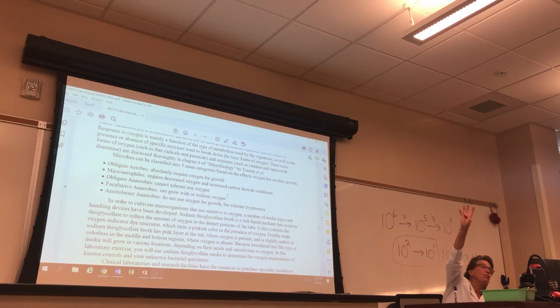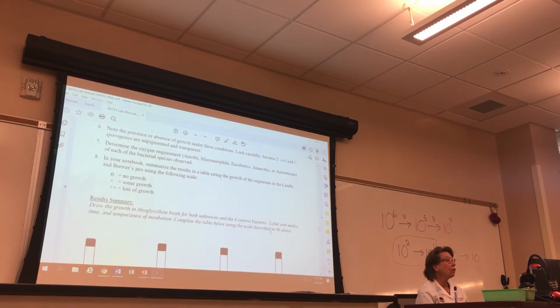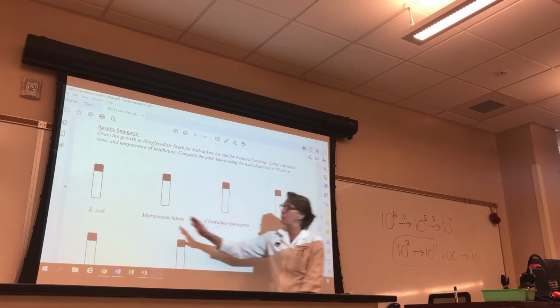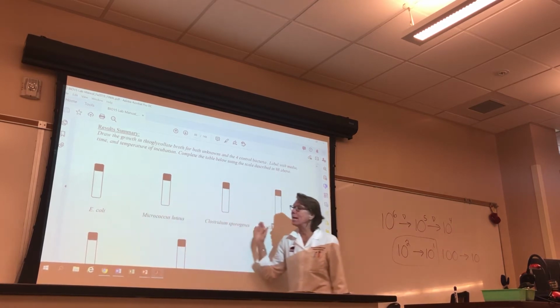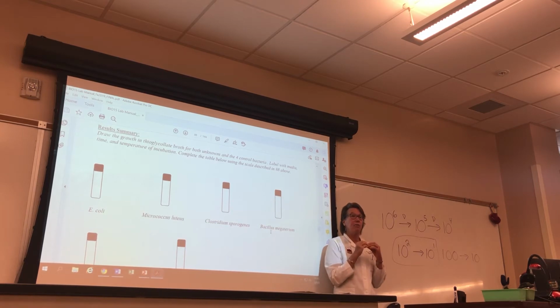Lecture test, you just need to know the four most common ones. Okay, so just to make it a little easier, you just need to know the four most common ones. And to kind of show you that, we're going to show you 4 control organisms growing in thioglycolate media. Thioglycolate is a reducing media that gets rid of the oxygen in the broth.